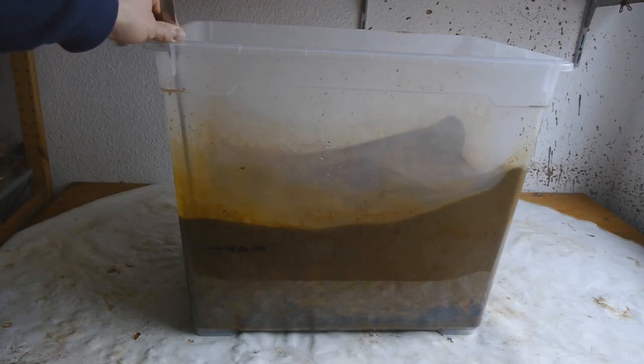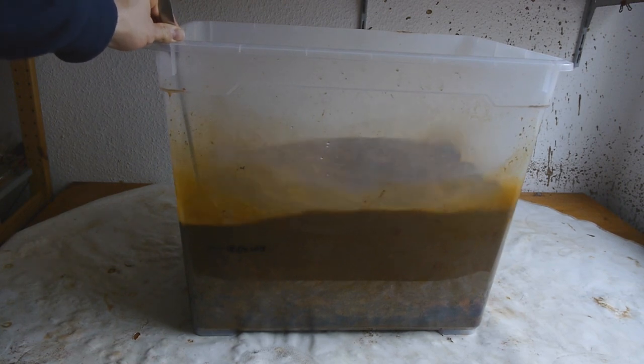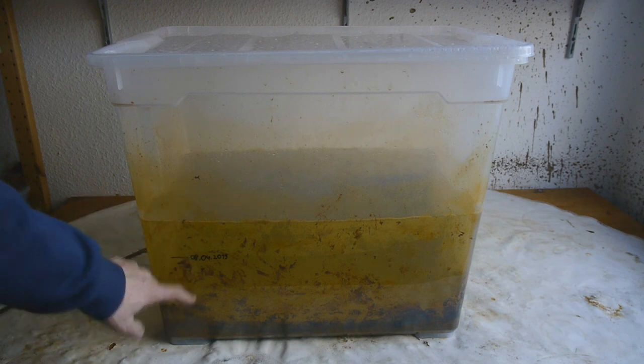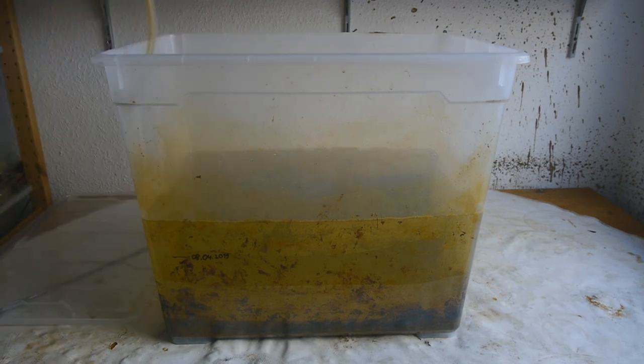Okay, this should now be nicely mixed up. And now we just need to wait until everything is settled out again. Everything has settled out nicely overnight. You can see that the volume of the iron oxide has shrunk quite a lot. Now we just need to siphon off the water.